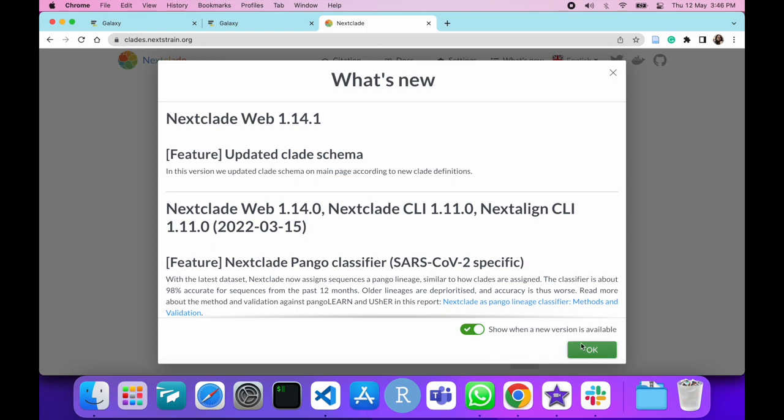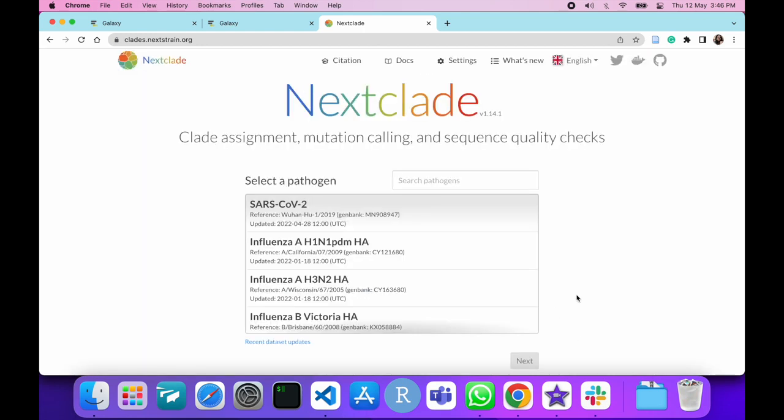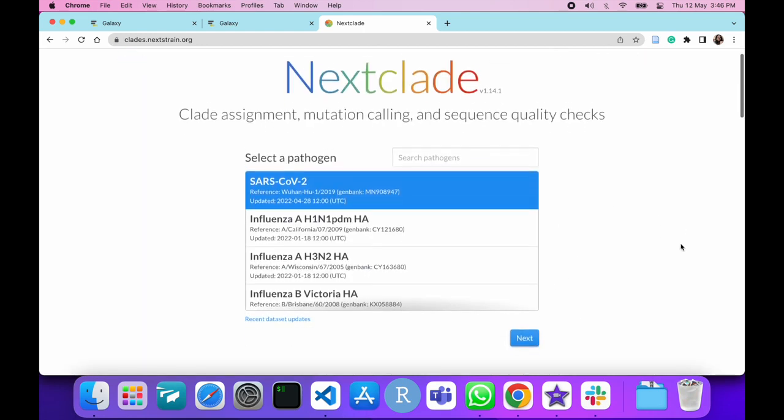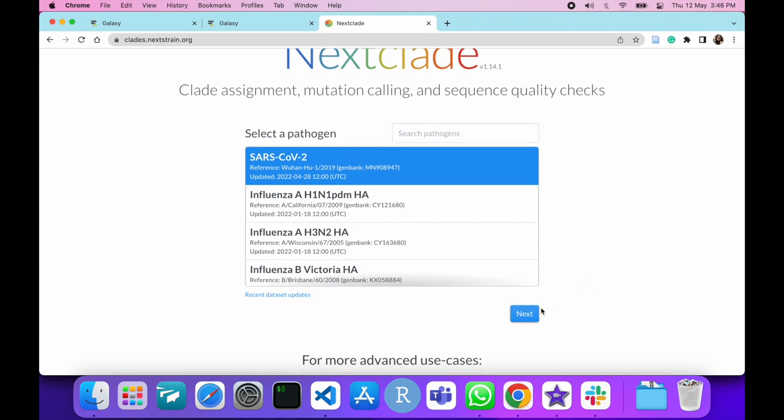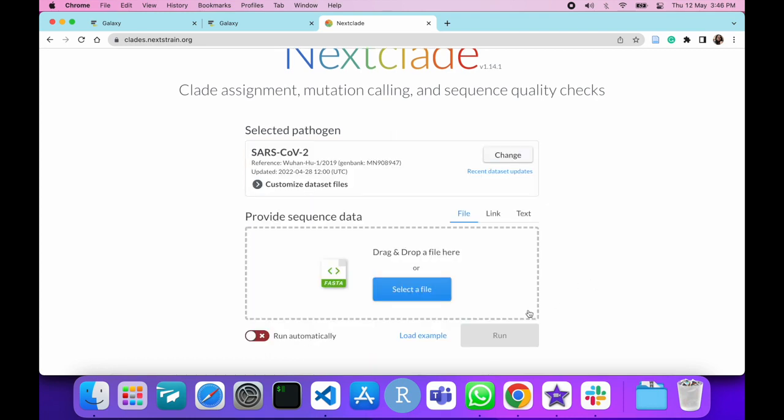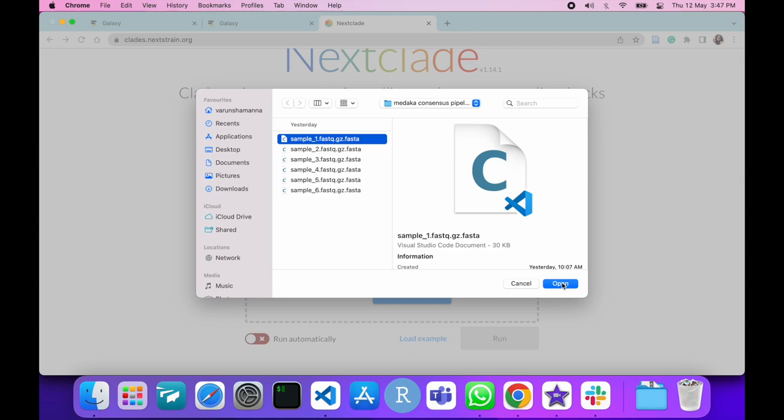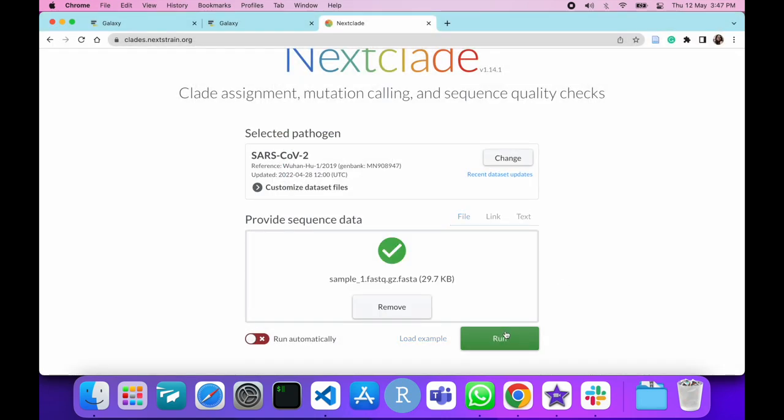Continue to select SARS-CoV-2 as the pathogen and press Next. Here you can select your input assembled genome. Click on Select File and select one of the samples. Continue and click on Run.